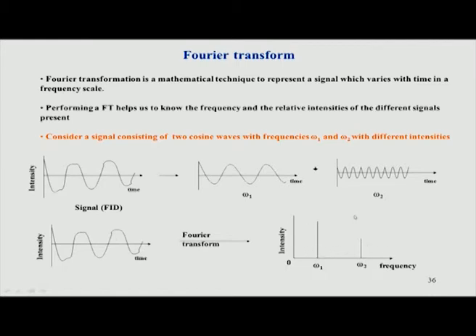So, this is how a spectrum is recorded. Basically, you record a time domain FID, the FID is automatically combined, because that is how the whole signal will be detected, and upon Fourier transformation, which is typically done by the computer automatically, that will give you a spectrum.